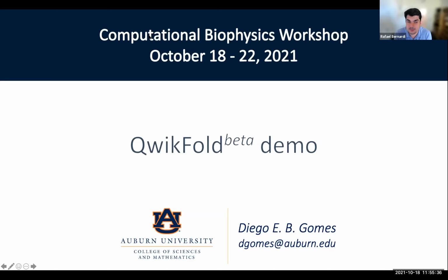I want to know if it is easier with QuickMD, or it doesn't do anything for the force field. I don't know how to tell you if it's easy or not, because there is a very easy way in VMD. But in QuickMD, you just tell the protein and you get the PSF. You don't need to select anything. It's automatic. But there is a way of doing that in VMD already with the AutoPSF tool.